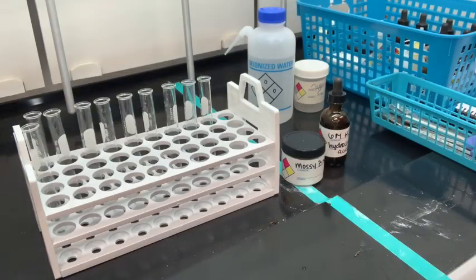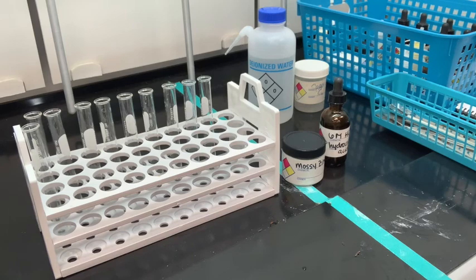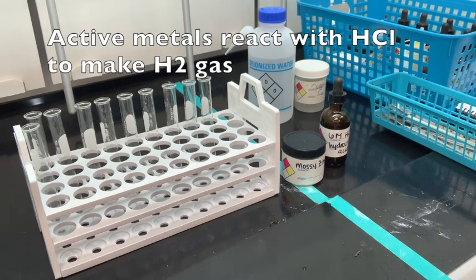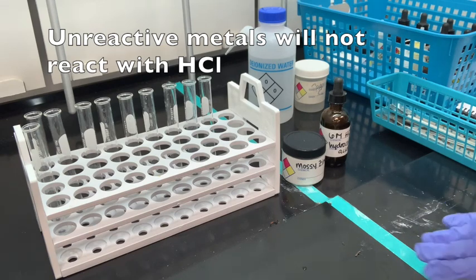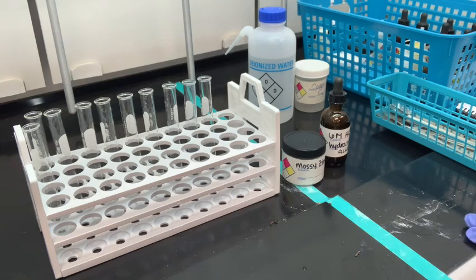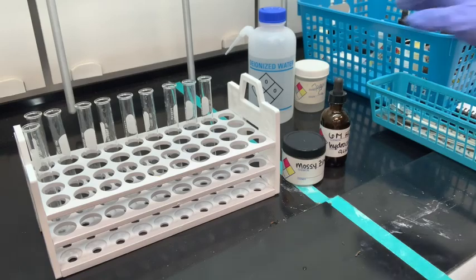Okay, we are moving on to oxidation reduction reactions. So what you're looking for here is to decide if you have some active metals or non-active, non-reactive metals. Some metals are going to react with hydrochloric acid, HCl, to liberate or to make hydrogen gas. That will be an active metal. Unreactive metals will not react with hydrochloric acid to create any hydrogen gas. So we're going to look at zinc and copper and how they react or not react with hydrochloric acid.